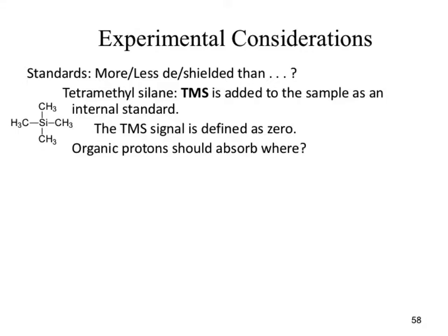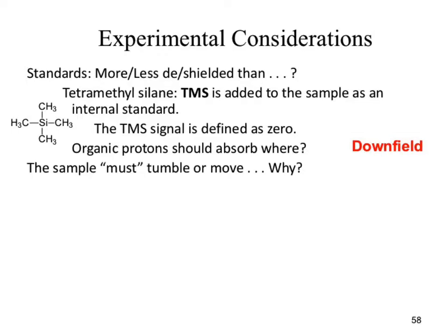Okay? The next part. Okay? Our organic protons are going to absorb to the left of that because they are less shielded. Left? Where's my spectra? I always get them backwards. My left and rights, that is. 0. Hey, I got it right. To the left of that. Okay? Because they would be less shielded. Okay? Tetramethylsilane is massively shielded. Okay? Less shielded can be known as deshielded. It can also be known as downfield. You may see those words. I always screw them up. Okay, so don't stress about that.